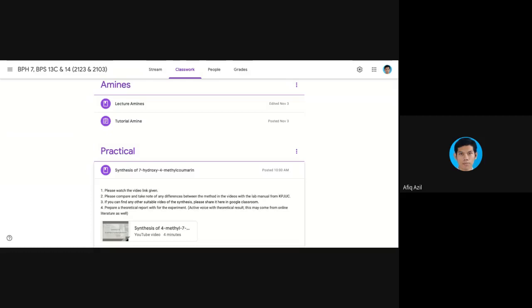But basically, for that experiment, it has been shortened into a 4-minute video, but actually in the lab, it will take about maybe at least 1.5 hours for you all to complete. Okay, some even for your seniors it will take two, maybe even until the end of the lab sessions. They just obtain the final product. Okay, then we'll see the other experiment.